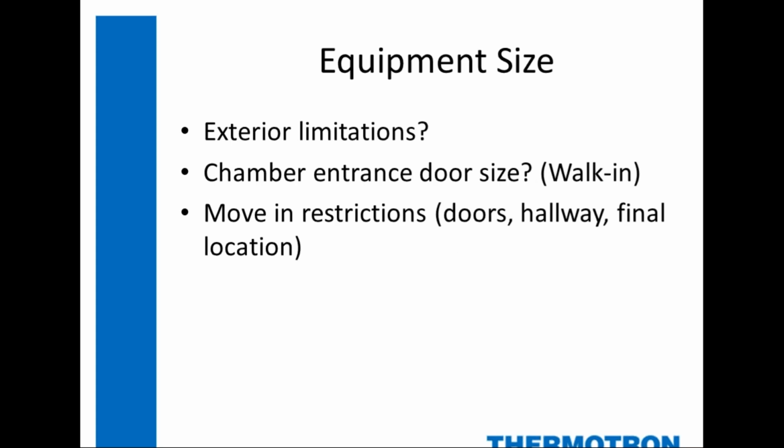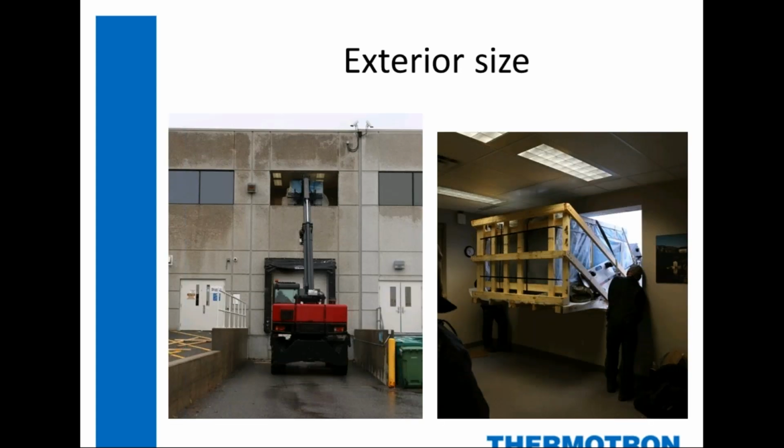And then some of the facilities items, just looking at exterior limitations. Can you move it into place down the hallways? Will it fit into the lab that you're considering? Here's just a quick photo of somebody that couldn't physically get the chamber into their lab down the hallway. So we ended up building some special packaging for it, and they lifted it up through the window.